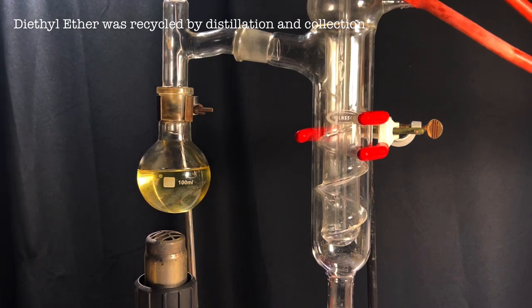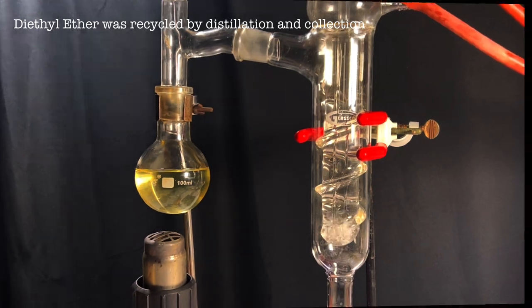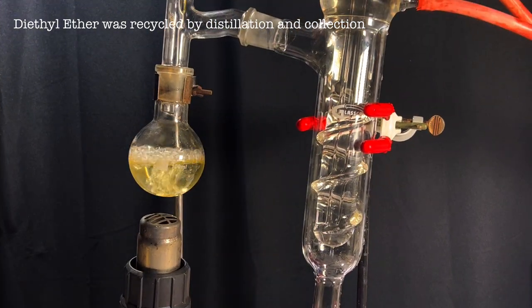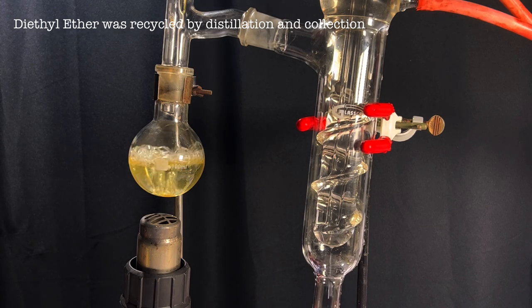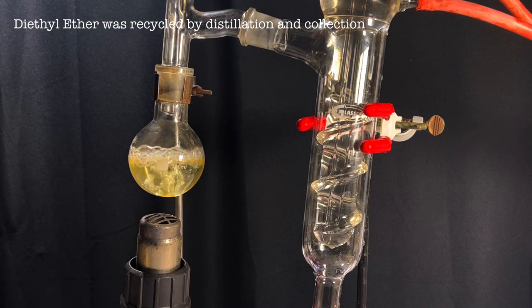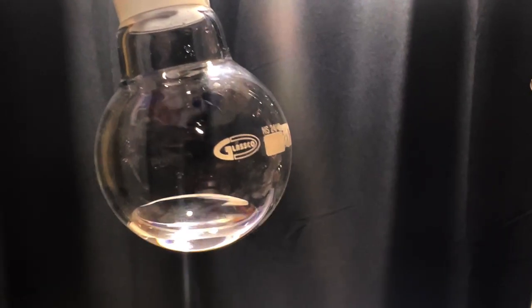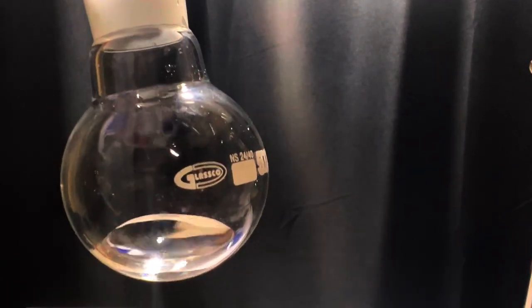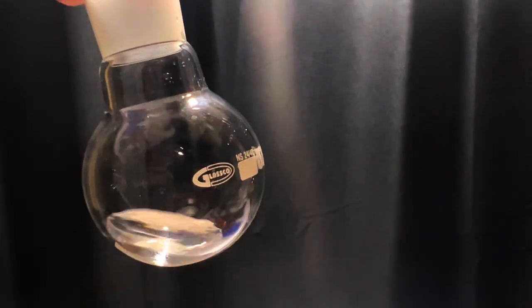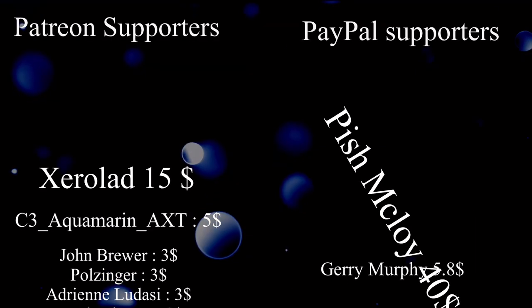In this process all the diethyl ether was recycled. Finally the product n-butyl benzene was collected at 184 degrees Celsius. The product is clear but a little bit greasy in appearance. I got 3 grams of the product which is less than the amount mentioned in Vogel's, that is 4.8 grams.